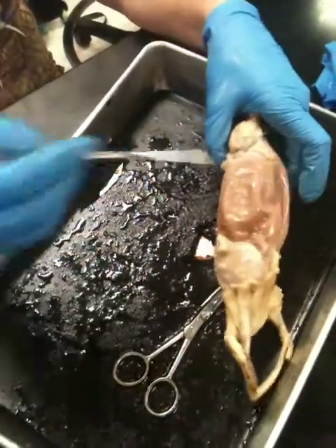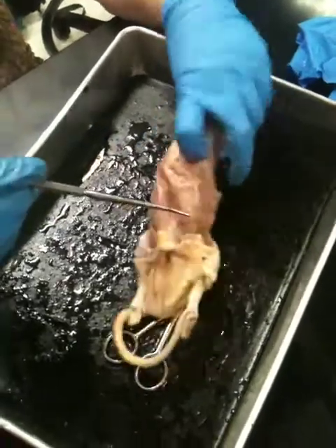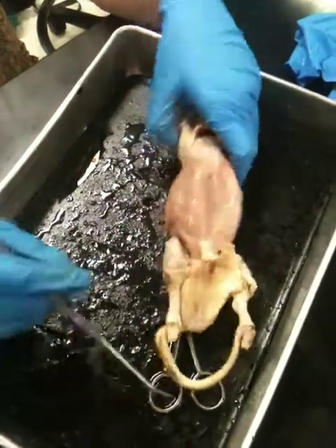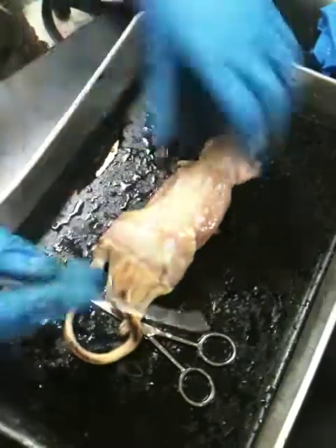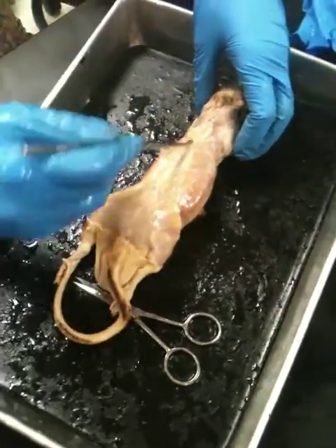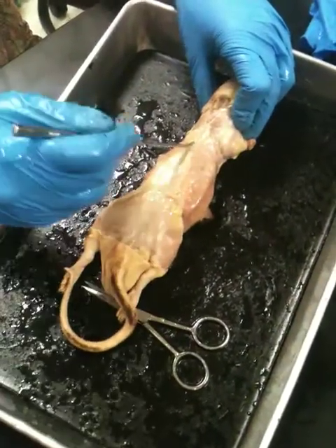Now, coxal, think about coxal like hips. So something off to the side right here, or off to the side right about here, is going to be your coxal. If we now flip it back, we're going to see the vertebrae. So anything along the vertebrae itself is vertebral. In terms of subdivision, this is vertebral.